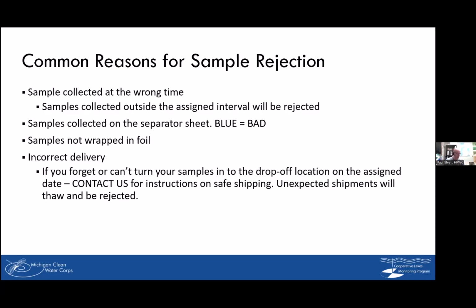Remember that we're dealing with algae here, and algae like sunlight. So the whole point of the aluminum foil is we're 100% blocking it from any kind of light that could prevent that. Otherwise, the light would still allow for a little bit of growth. So you keep stuff wrapped in foil.